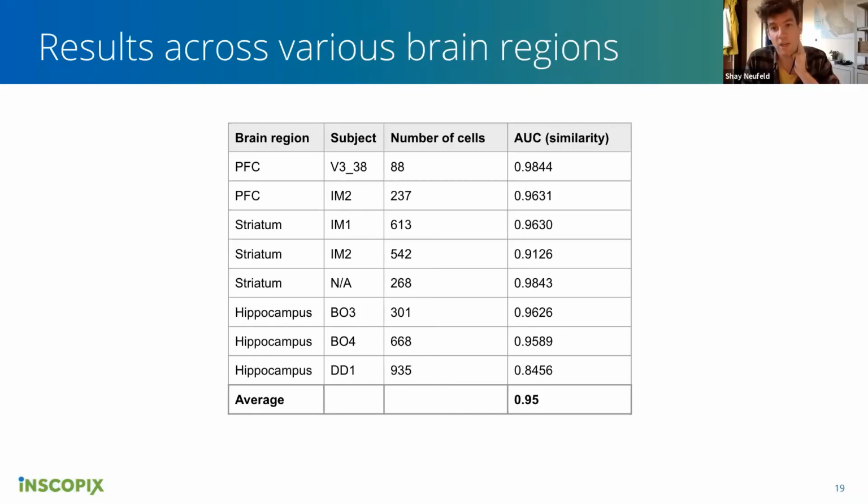At the beginning, we were really concerned about matching CaImAn's outputs as closely as possible, and that's what we did for about 90% of the development. Once we were really confident that ours was good, that's where we started to tinker and see where we could improve.